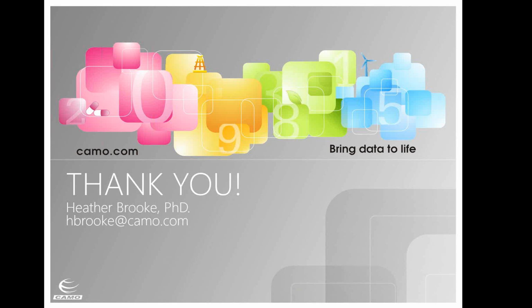Can you actually get information on the particle contents instead of just filtering this information away? Yes, so this is why you need to be aware of what your application is and what information you're trying to get out of your data. If you're looking for information about particle size, for example, you don't want to get rid of some of that scattering, because that scattering is going to give you information about the particle size. If you're looking at other information, sometimes that particle size is actually noise. So you need to think about your problem and decide what is the information you are actually trying to get to.